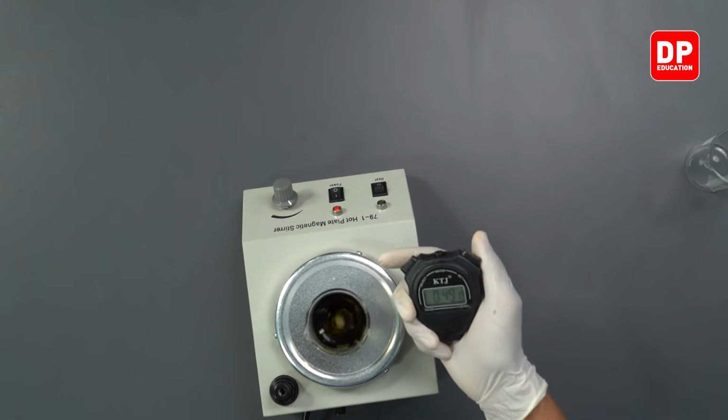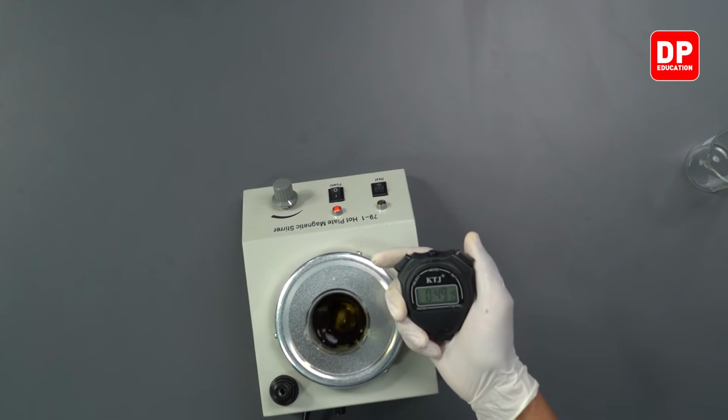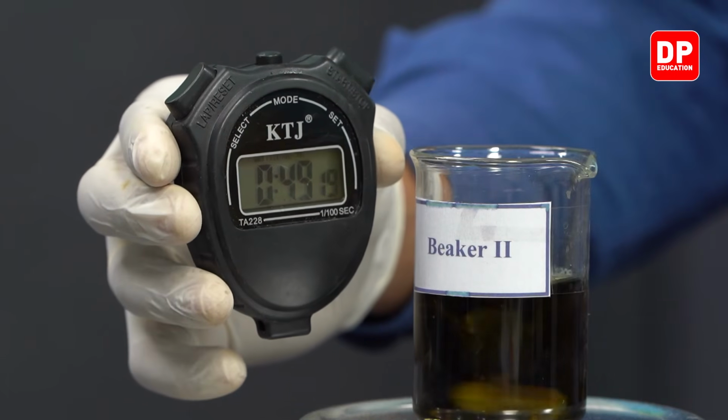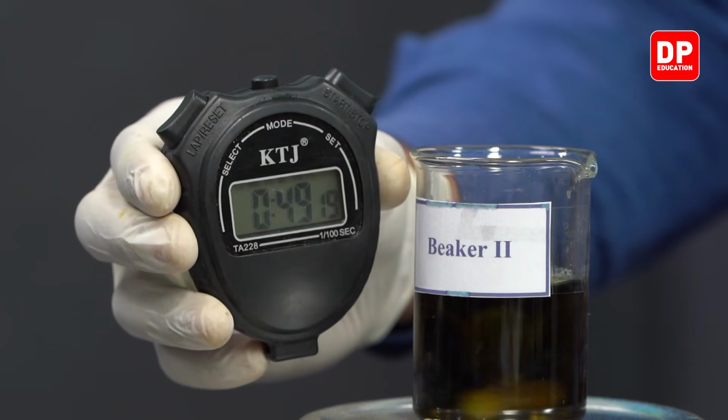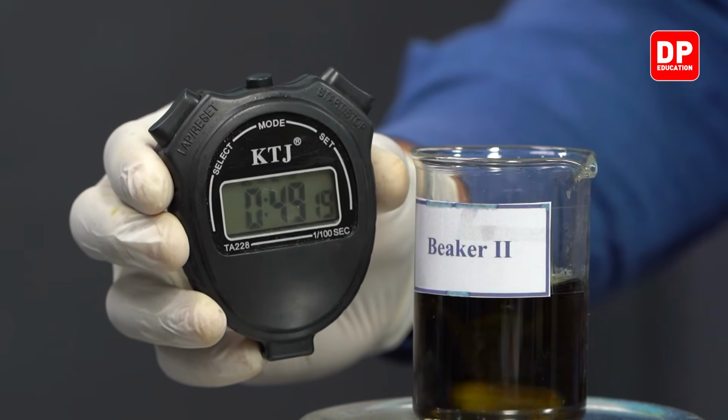Now students, the time taken for this reaction to show a color change was 49.19 seconds. As you can see over here, the time taken for the color change to take place was 49.19 seconds.